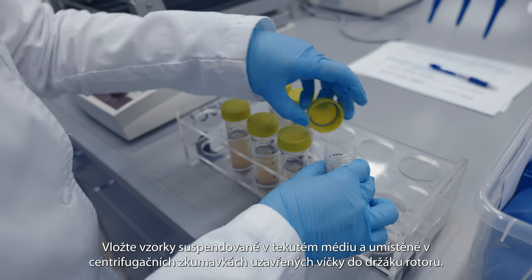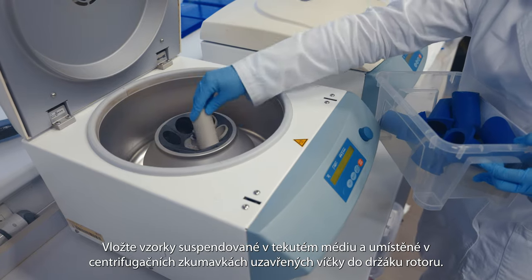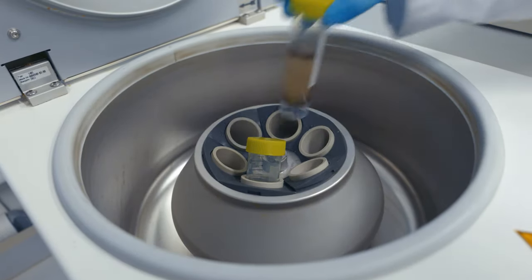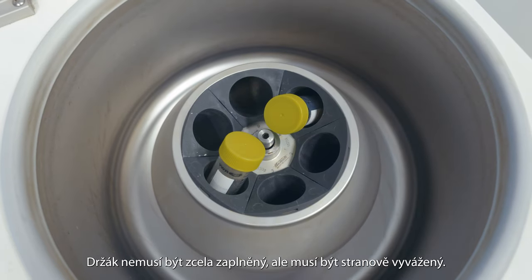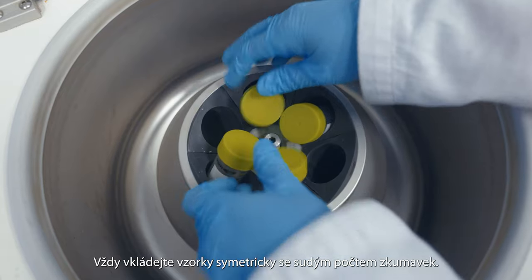Insert your samples suspended in the liquid medium and placed in the centrifuge tubes with tightly closed lids into the rotor holder. The holder does not need to be completely filled but must be laterally balanced. Always load samples symmetrically with an even number of tubes.